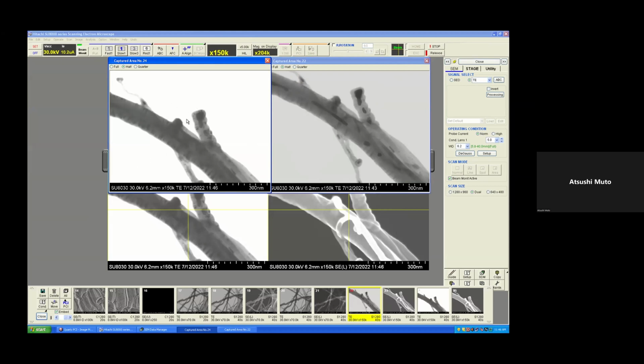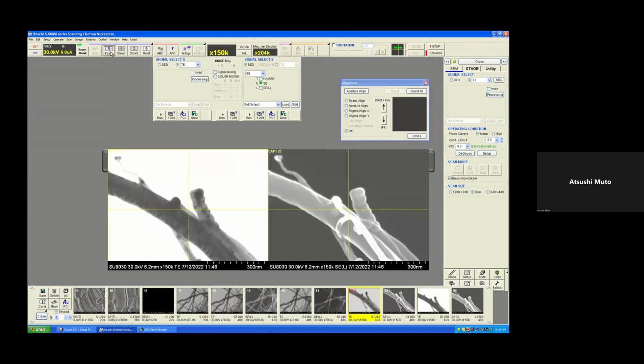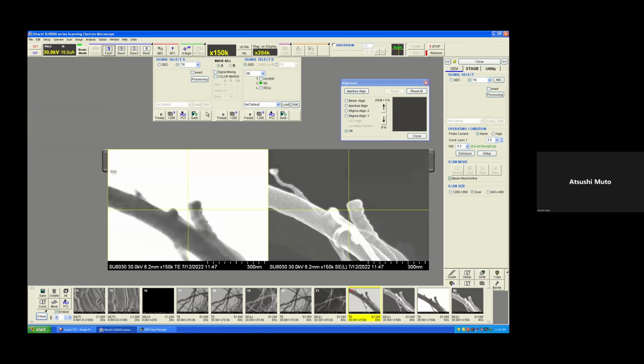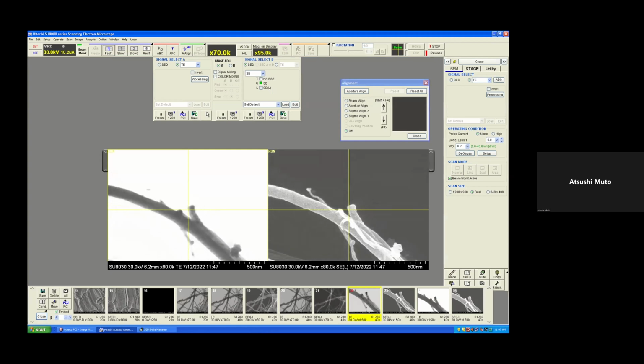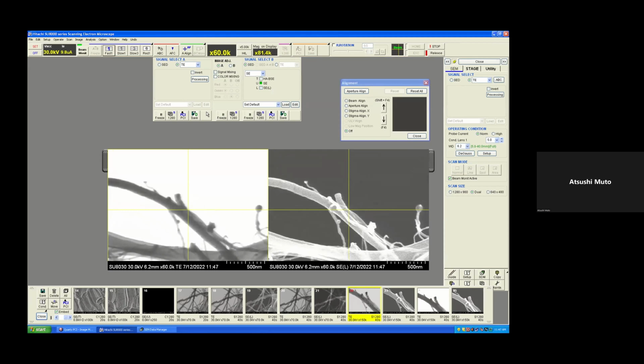So the STEM aperture can increase the contrast, especially for very thin sample areas, but in thick sample areas, the penetration is more sensitive to the sample thickness. In thicker areas, we tend to lose the information. So that's a pro and con there, but if we utilize this aperture, I'm sure we can get a very nice quality image.